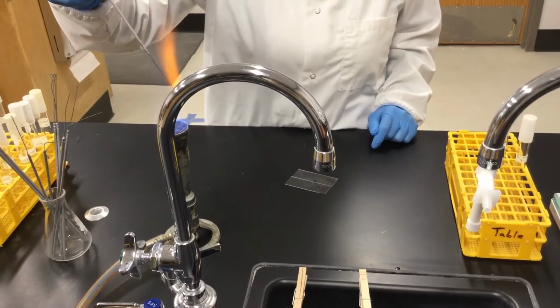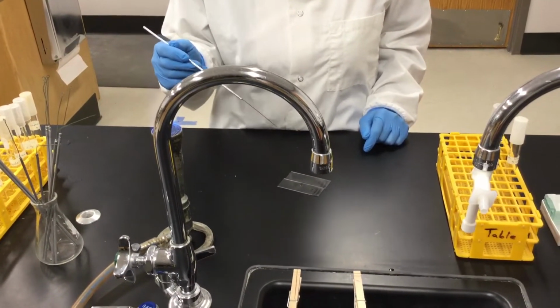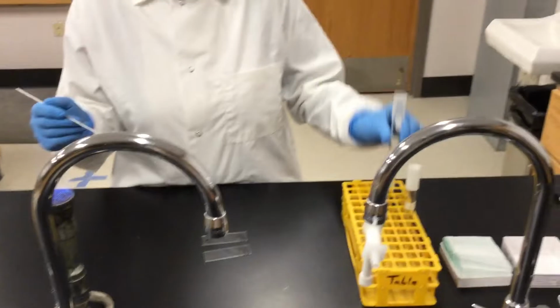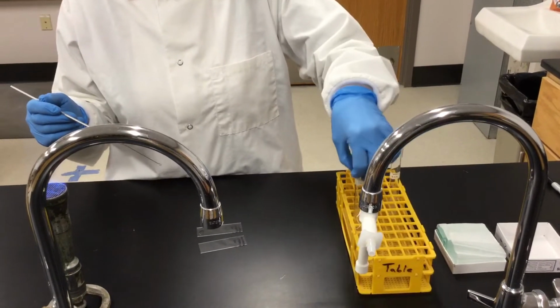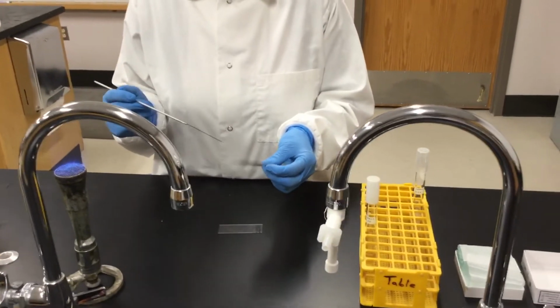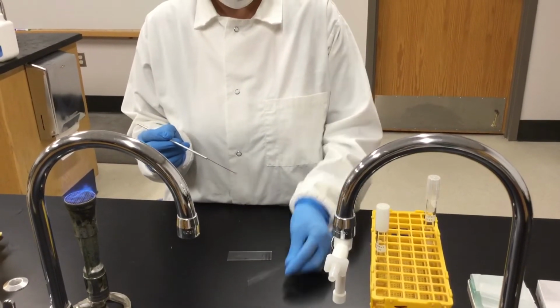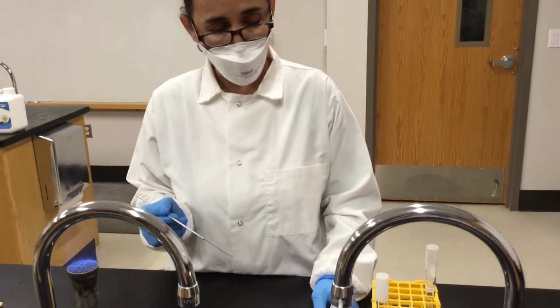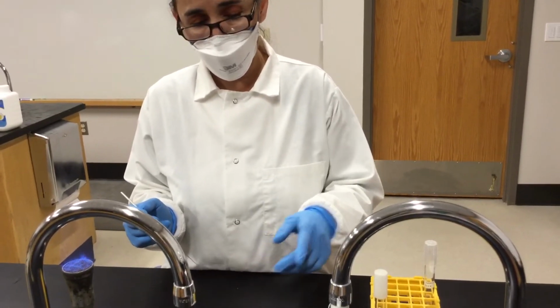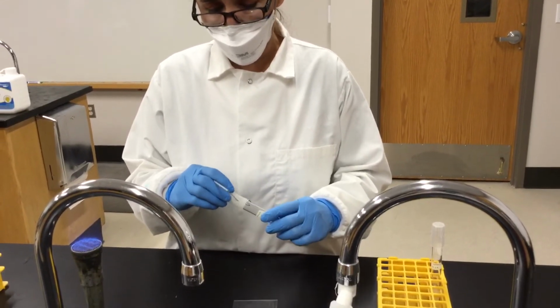I wanted to do this smear very quick for the simple stain and the negative stain with this liquid media, so I don't have to use the water. And sometimes you don't want to work with that part that you put in the bottom, like in the case of the negative stains, just because all the slide is going to be covered with bacteria. Now, I think I said that you will heat fix the slide when you are doing the negative stain, but no, you don't do that with the negative stain.